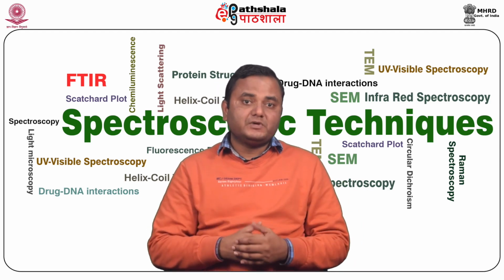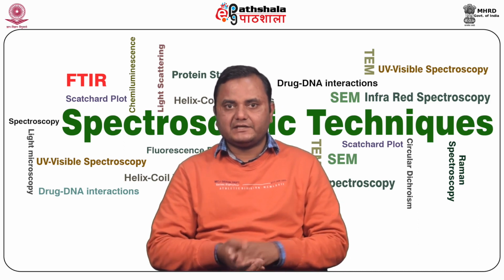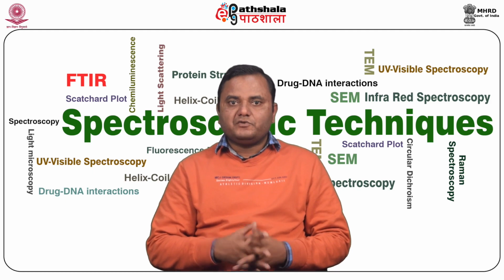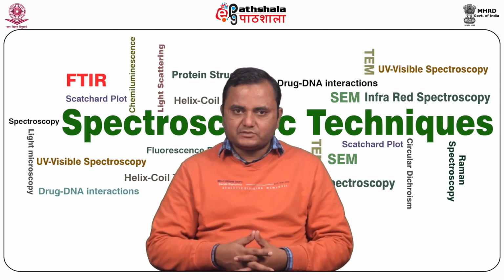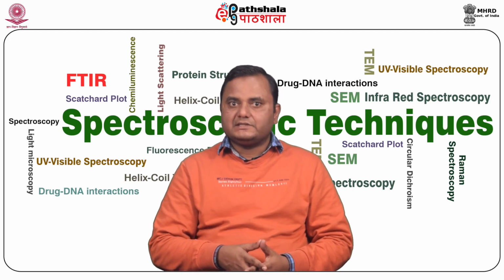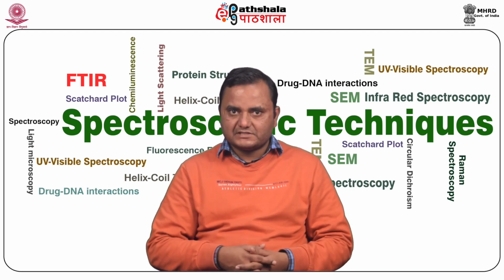It is also used to monitor changes in fluorescence parameters to determine stoichiometry, like the presence of intermediates, binding constant, number of binding sites, etc. So fluorescence is a widely used technique for the determination of the biochemical structure of DNA, proteins and ligands. I'll discuss one by one in detail, like microscopy, which is used for the detection of protein, RNA, DNA, lipids, calcium, and other metal atoms.